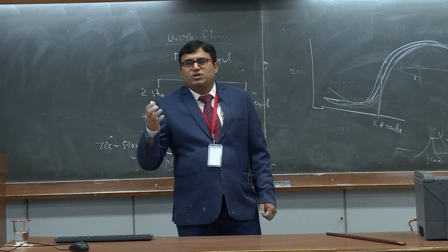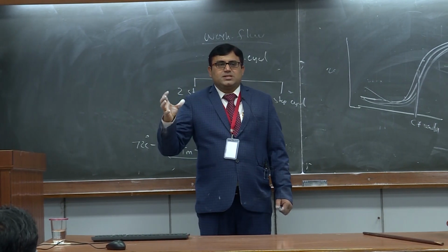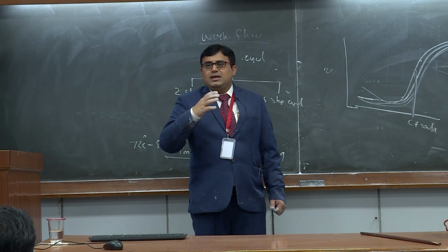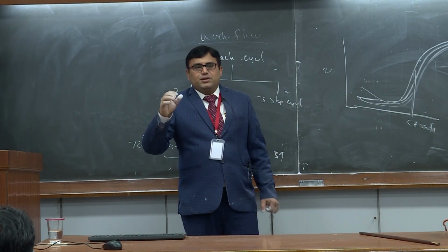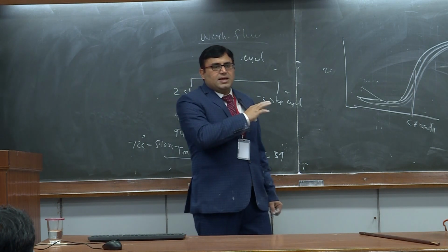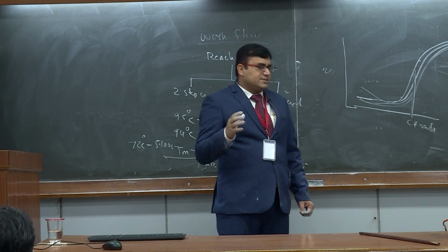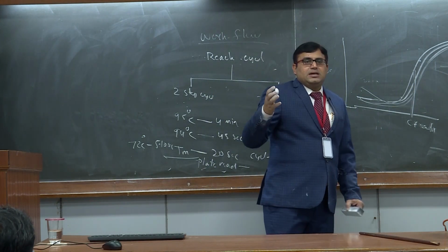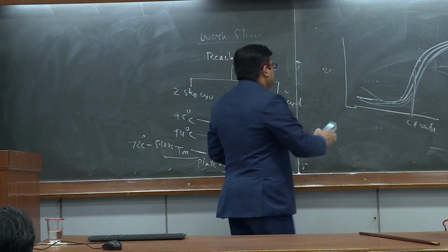Let's have a look, even though it will be difficult to explain here because this is an Excel-based function. But I will try, and when you go back to your hostel, you can easily feed it in and get that result. So this is the last part, and then I'll stop after that. We'll go to the lab and do the practicals. So, how to calculate the relative fold expression based on the CT values.